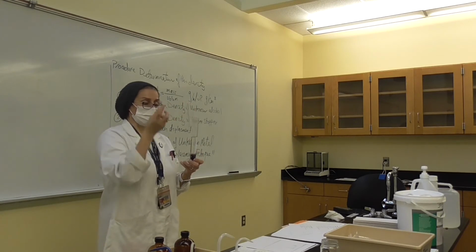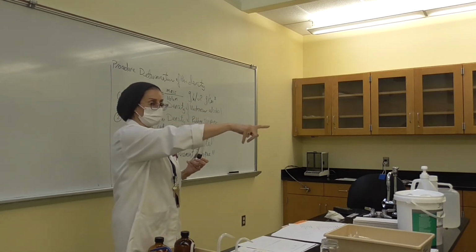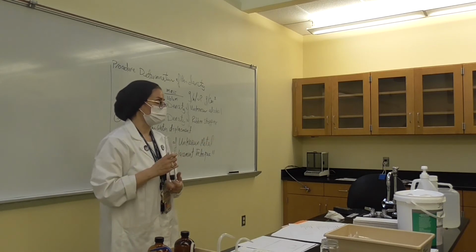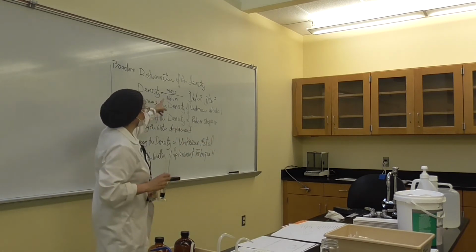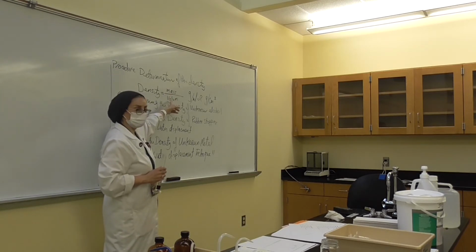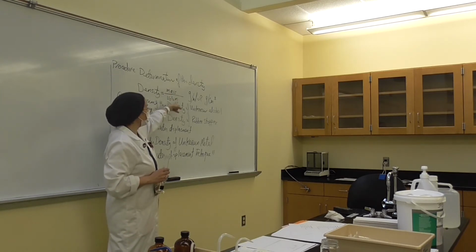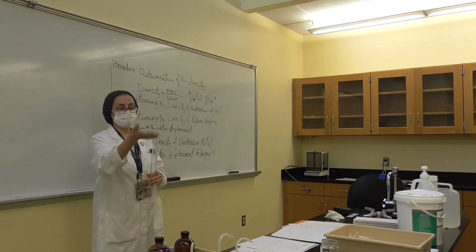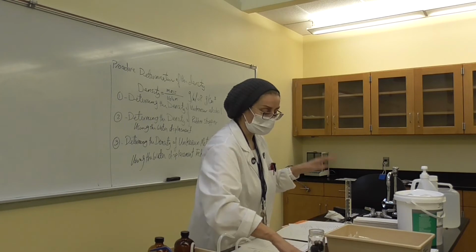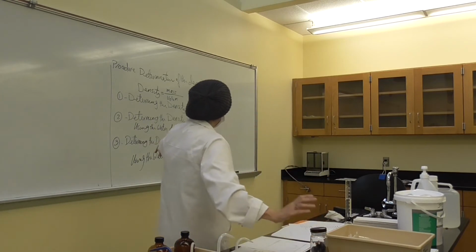Now the weight, you're going to weigh it in one of these scales. And again, you do the same thing. You have the mass of the rubber stopper, you have the volume of the rubber stopper, divide them, you will calculate and find the density. We do the same thing, that's part 3.